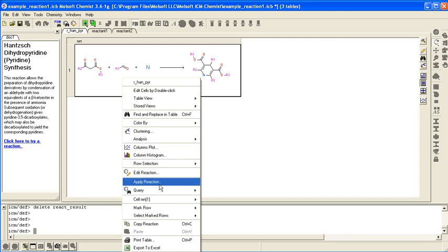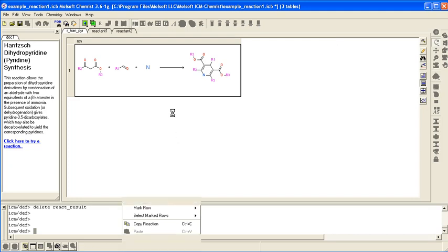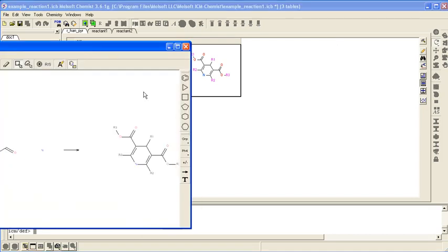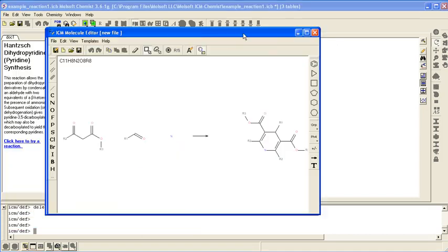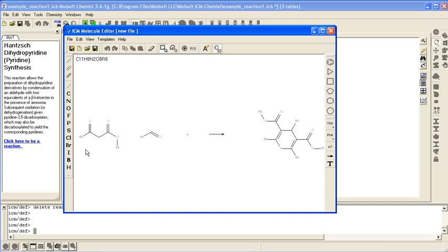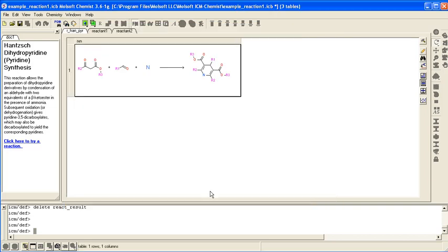If you right click and say edit reaction you can see the reaction. You draw your reactants and your product. The arrow is here. This example by the way is in the distribution.